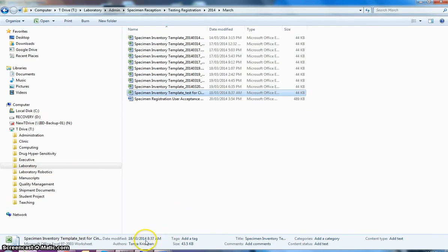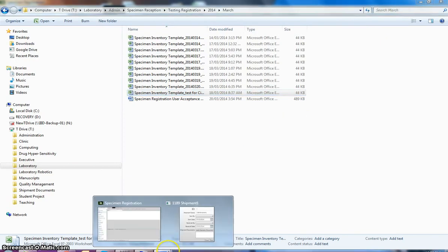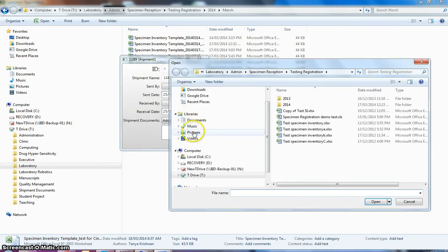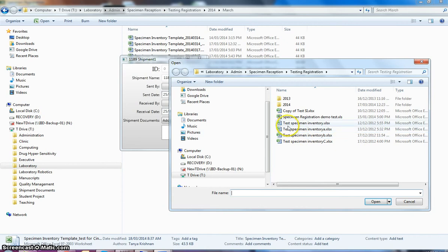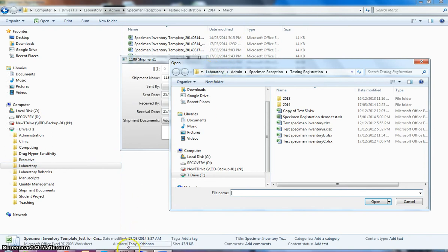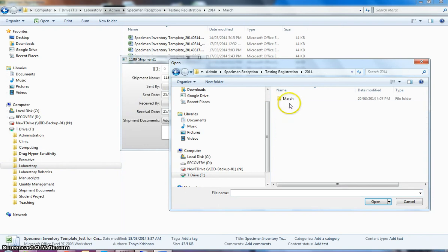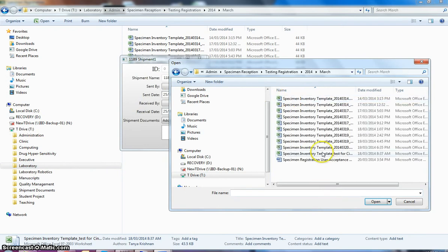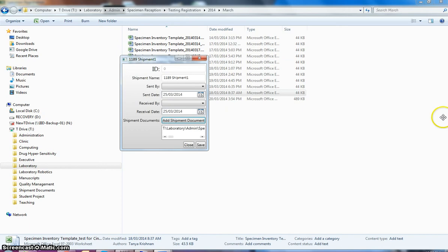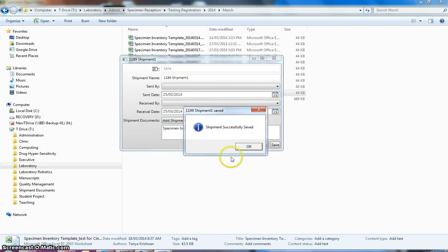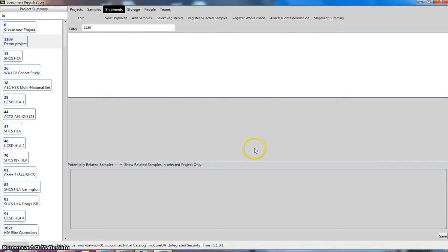So we'll show you how to import this data into our LIMS system. So if I just close that and go back to the registration software. So these documents, we can assign any kind of document to the shipment. So if we go add shipment document, we can assign this document to our shipment. So if we just select our spreadsheet that we just showed you. And as we can see that that's added to the list of our shipment documents. So we can save that in our shipment. We should come up with a confirmation dialog that our shipment has been saved. So we can now see our shipment in the list of shipments.